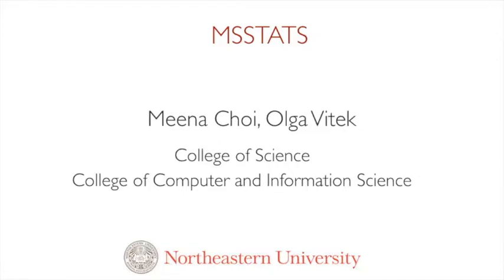So if you are just joining us, just to tell you a little bit what we have done so far. The first 2.5 days, we spent some time talking about working with very raw data, with types of data acquisition and also working with raw data as they come out of the mass spectrometer. And so we had some people working with Skyline and talking about targeted experiments, designing assays, interpreting assays, and so on. And some people worked with OpenMS, working primarily on shotgun quantitative experiments and also metabolomic experiments. And then the second half of the day, we also had two groups. One group focused on programming with R. So this was some fairly advanced concepts on how to write your own programs and develop software with R. And the other half of the group worked on just an introduction to R and also an introduction to statistical methods.